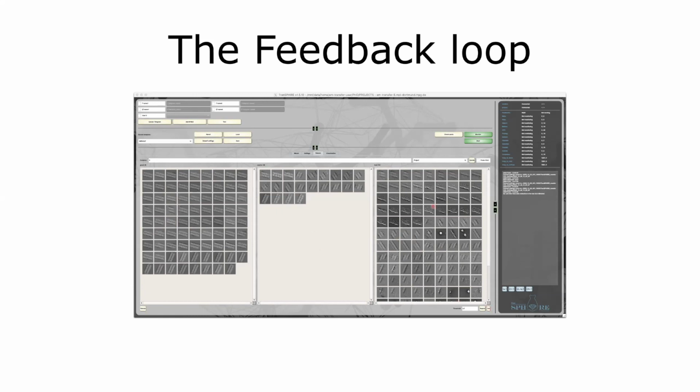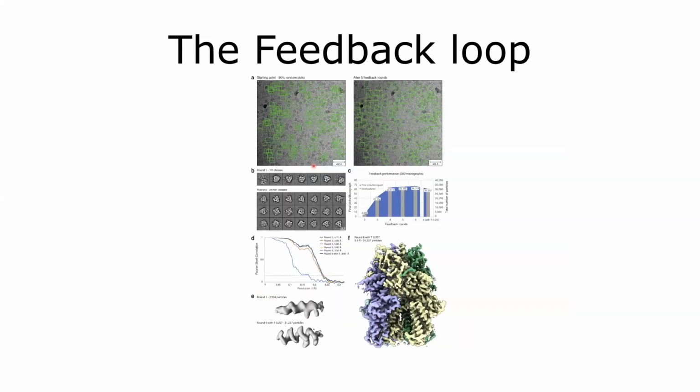In the end you hopefully get a satisfying result, and you can click on set, click on start, and click on redo feedback. Once you have clicked on redo feedback, it will redo all the feedback steps again, but now you're sure that the Cinderella model works as intended and gives you the best possible outcome. With this feedback loop, we made some experiments.